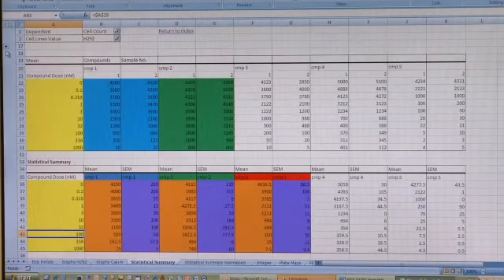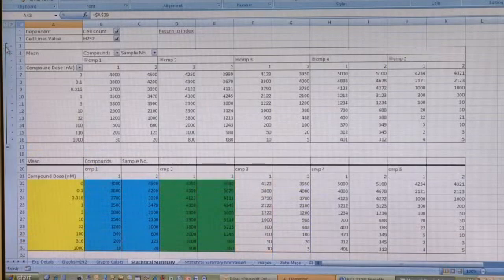You may have noticed the plus sign on the statistical summary page. If you push this, then another table is revealed. This table is the actual Excel pivot table of the data, and you should normally not interact with this table, which is why we hide it. However, if you understand Excel pivot tables and are an advanced user, then you can also modify this table directly to control how the final data is summarised in the statistical summary table.